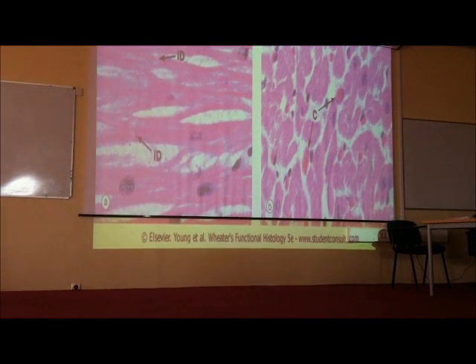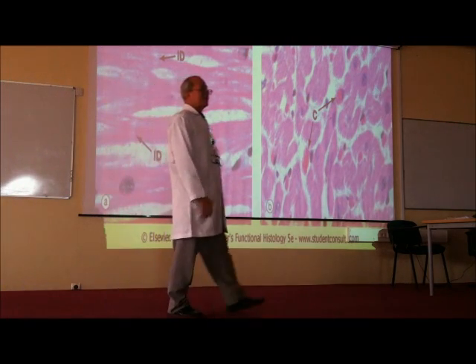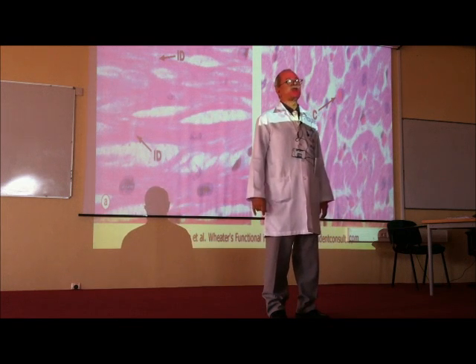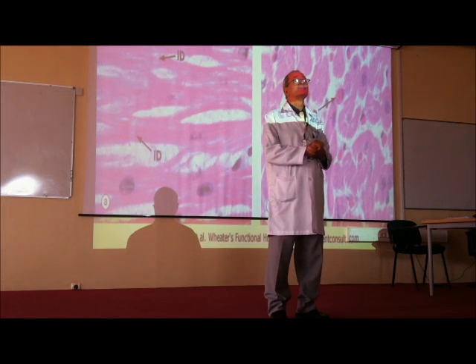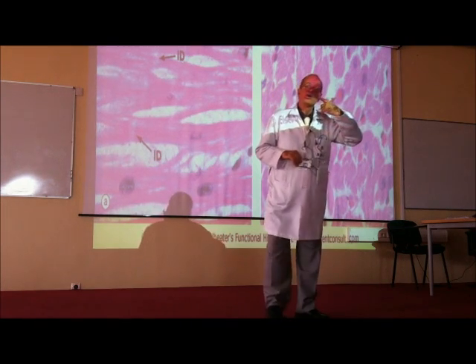Not in the exam. What is the type of this muscle? LS, TS. Cardiac muscle, LS and TS. Okay. What is the character of this cardiac muscle? Branching, forming a chain of cells, intercalated discs, nuclei central, one or two.